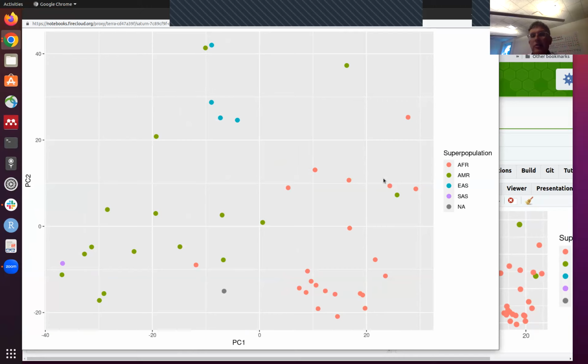But there's a nice package called snpStats that'll do that for you. And it'll give you only the biallelic SNPs, and then you can do a principal components analysis on the numerical representation of those genotypes. And what I see here is somewhat comforting. It's a very small amount of the genome, but it still shows reasonable sorting of contributors in terms of groups that seem to have common geographic origin.